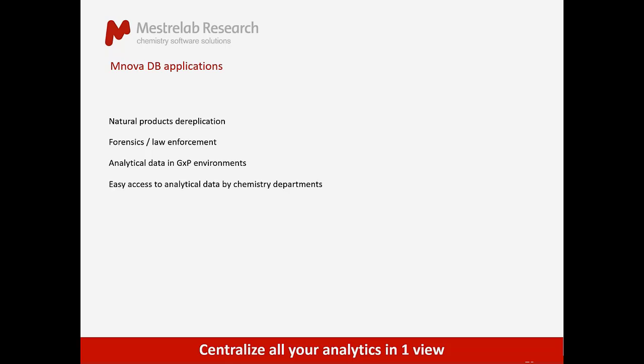separately. If you have an analytical department with several people that are doing maybe characterization, etc., this is a great way for them to share and to benefit from characterizations that other people have done. And it's also an easy way for chemists to access the analytical data.